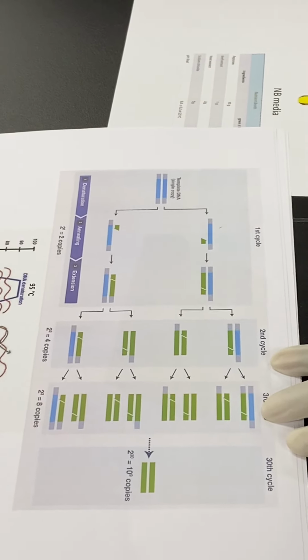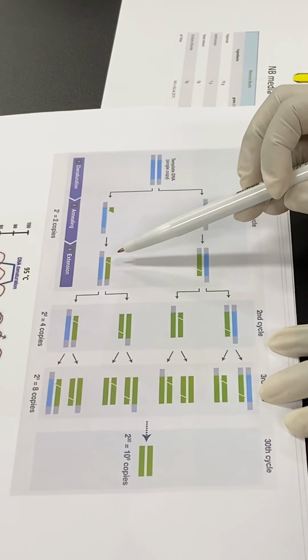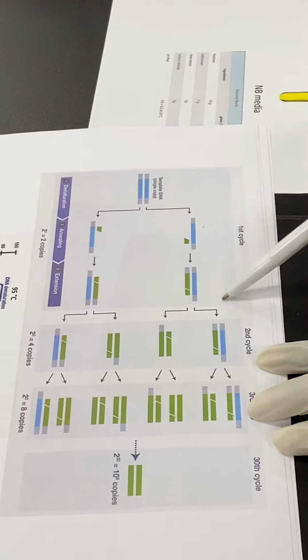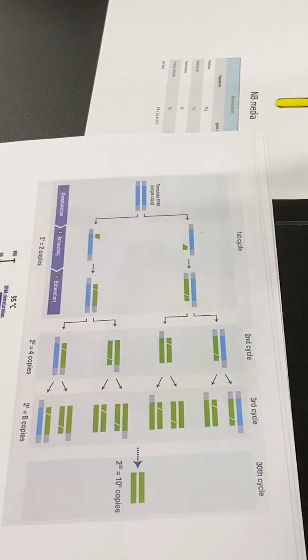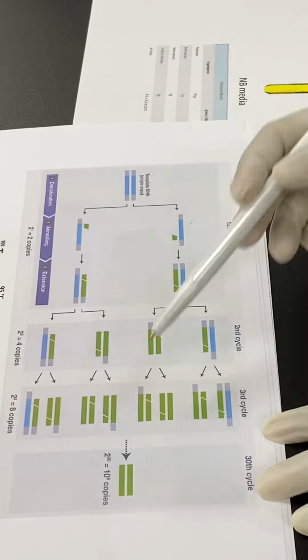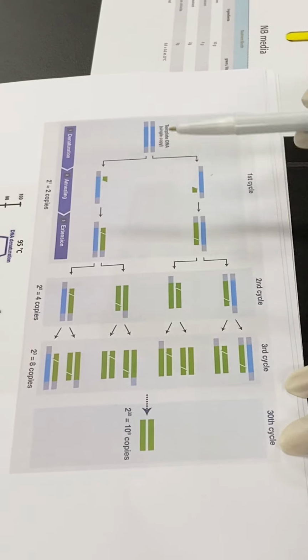We have these dNTPs, that are the building blocks of the DNA, and with the help of the enzymes and the reaction buffer, it will make another strand, and there are two complete templates that are similar to the first one. Likewise this process happens again and again, about 35 cycles. Ultimately we will get millions of copies. This is the polymerase chain reaction.